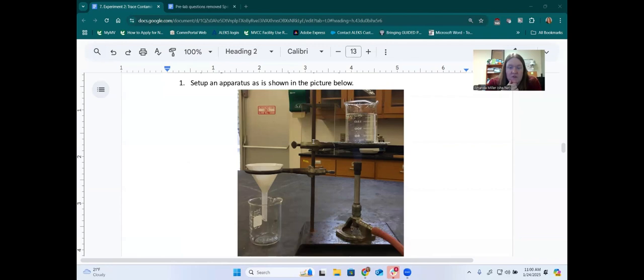What we're going to do is measure out the amount of our mixture and then add some water to that. Anything soluble in cold water would dissolve right away. But we're going to also heat up this water until it's boiling. You're going to want to use your stirring rod, the plastic or the metal one, to mix this occasionally.